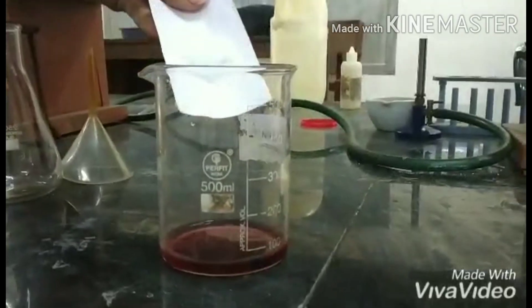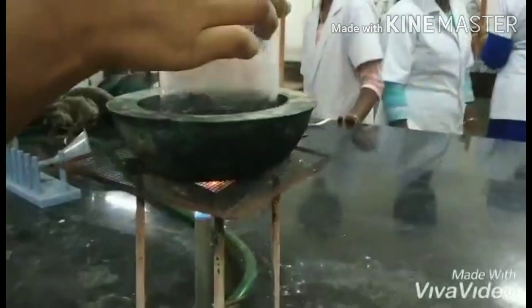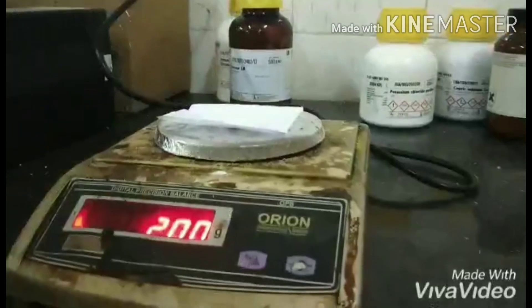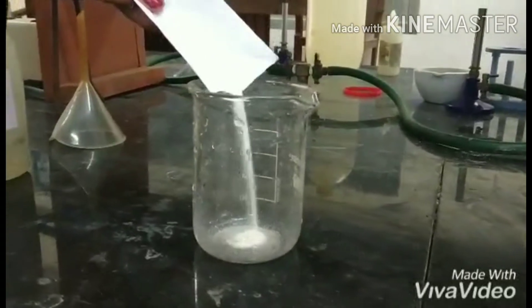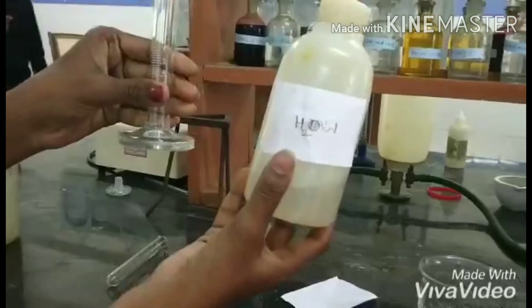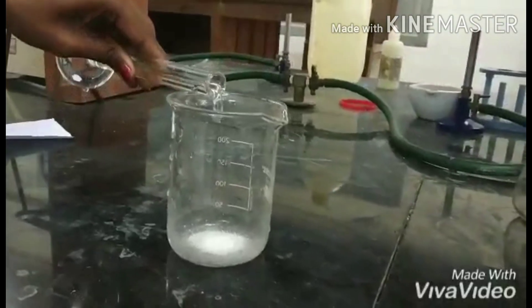Transfer the ammonium thiocyanate into the same beaker. The contents are boiled in a water bath. Separately, 2 grams of mercury chloride is taken in a separate beaker, and 10 ml of water is added to the same beaker.